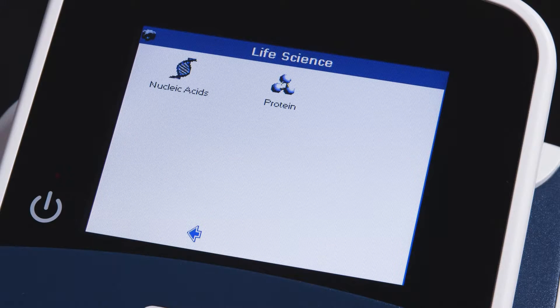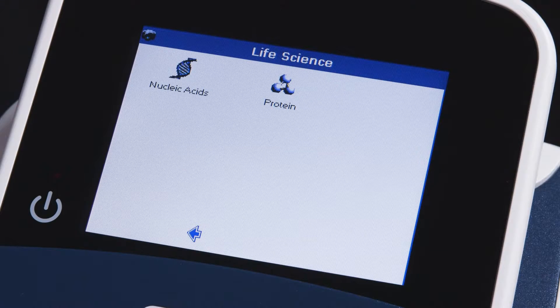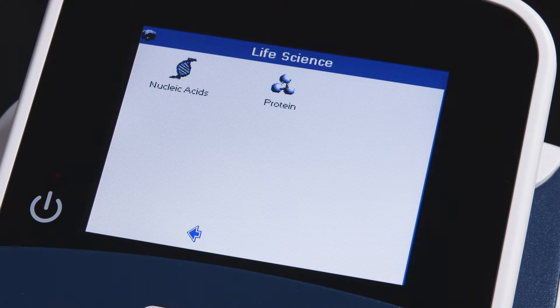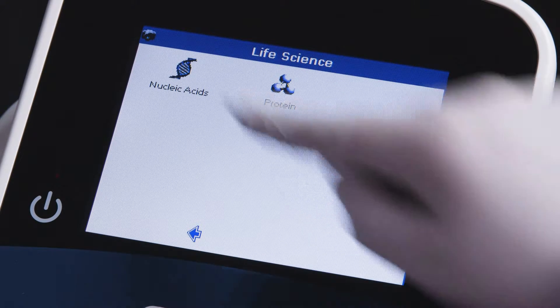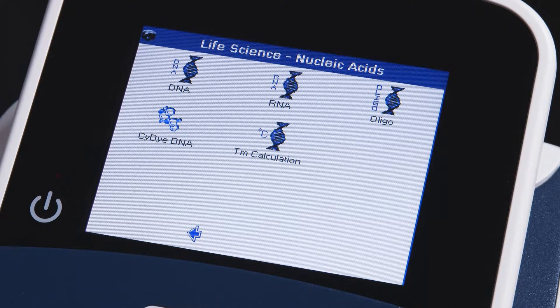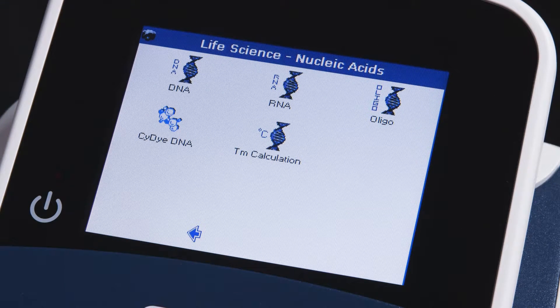Here you may choose between nucleic acid methods and protein methods. In this example we'll be reading nucleic acids. Next you'll have additional options to quantitate DNA, RNA, or oligo concentrations.